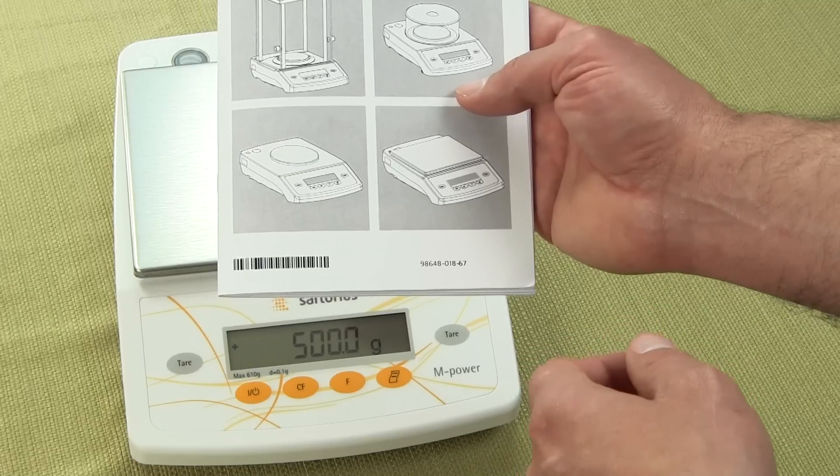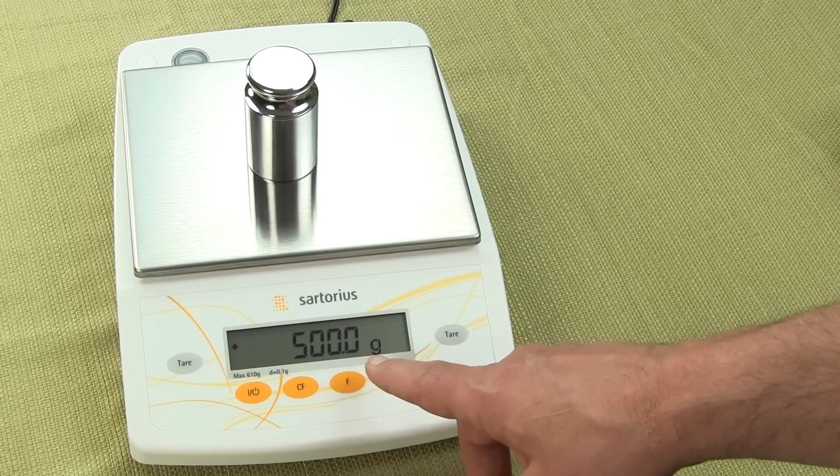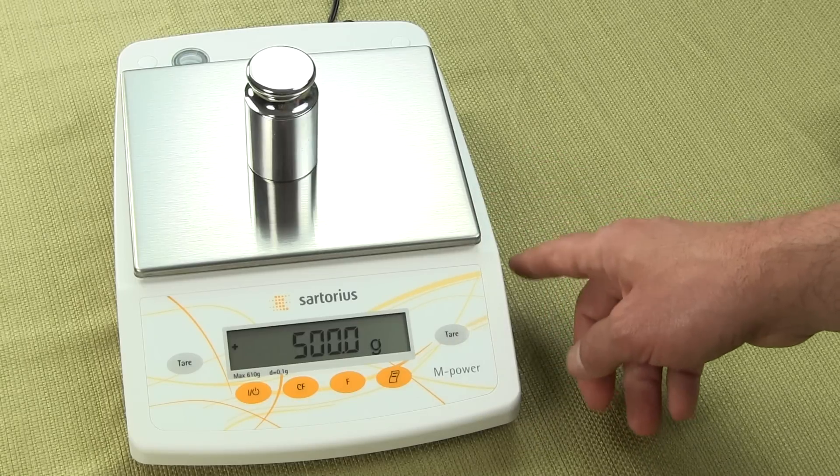And then finally, there are four models that are to a tenth of a gram — one decimal place. This is the AZ601. There's a 2101, a 4101, and finally a 6101.